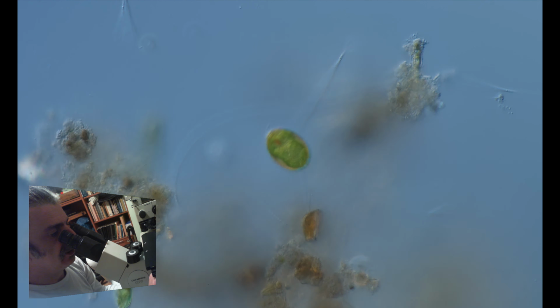The protective house is kind of spiny, and at the anterior part of it we can barely spot a flagellum, a single flagellum that this algae is using to catch prey and for locomotion.